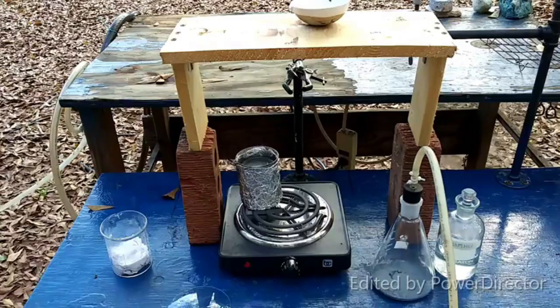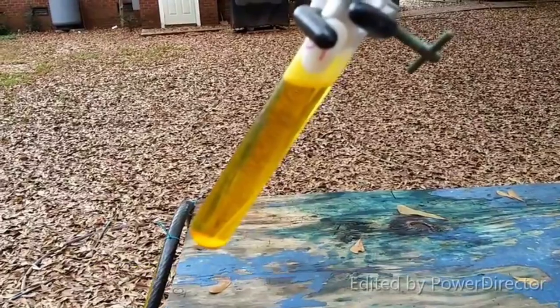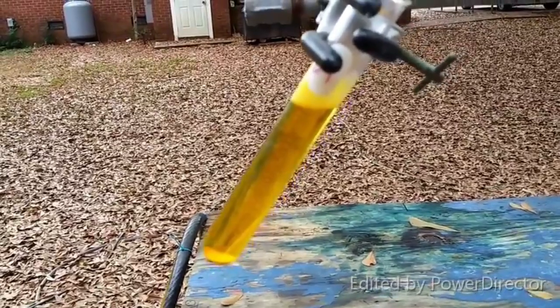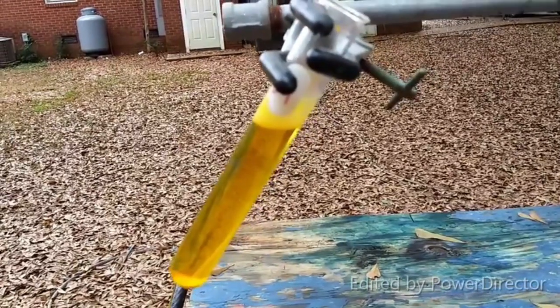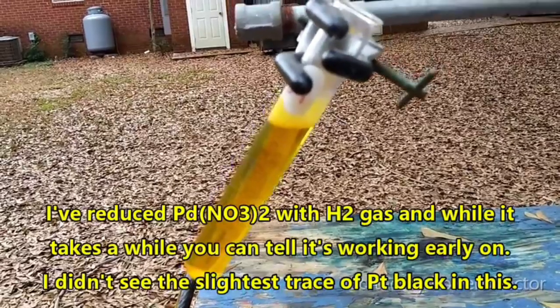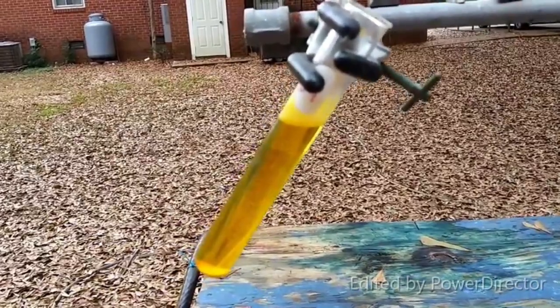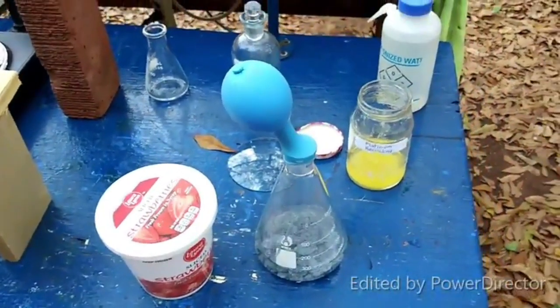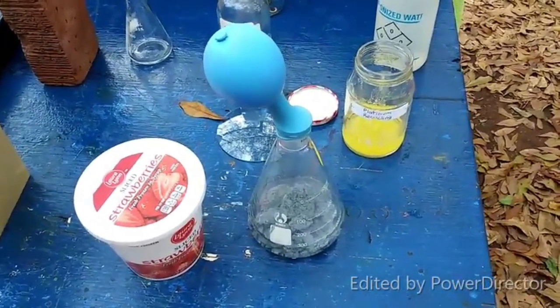So, neat, huh? Well, if that's a viable method for reducing diammonium hexachloroplatinate, I couldn't tell. It takes a lot longer than I thought it would. So that's okay, though. We can always see if we can reduce it by other means. Maybe try a little borohydride and see how that does. But anyway, it's okay. There are other uses for hydrogen gas, especially with glow-in-the-dark balloons. This should be fun.